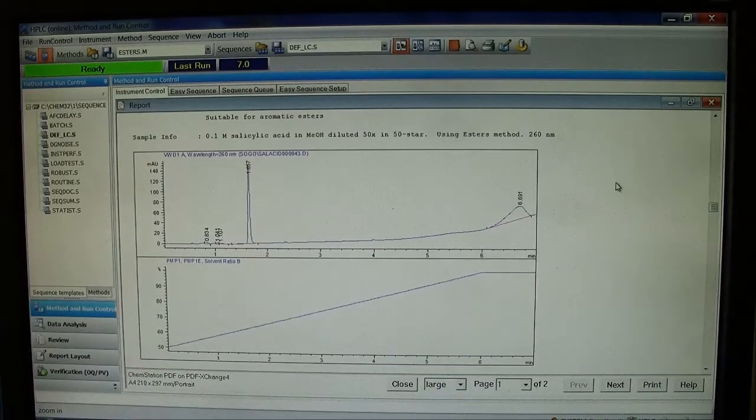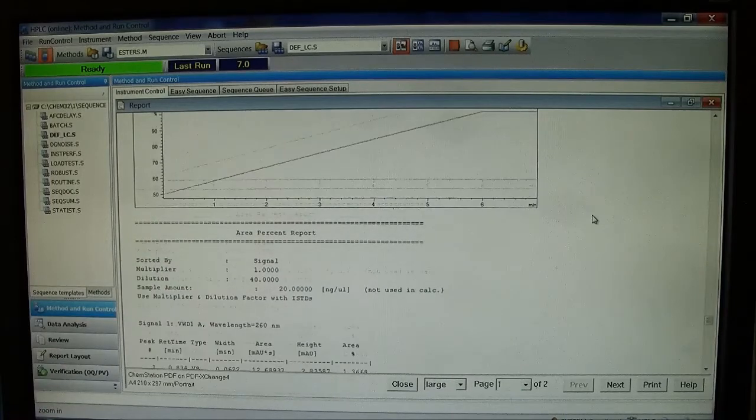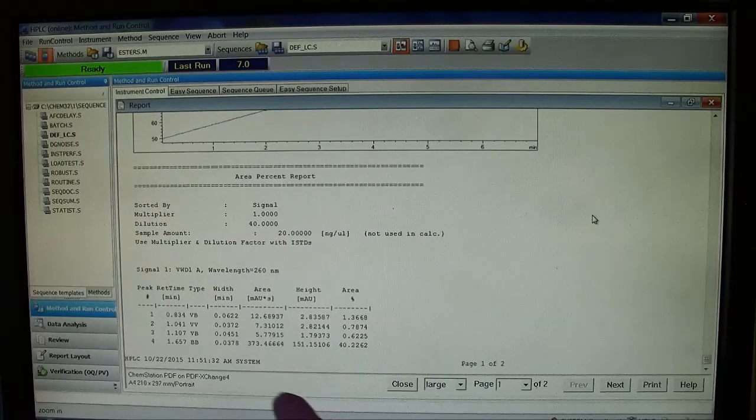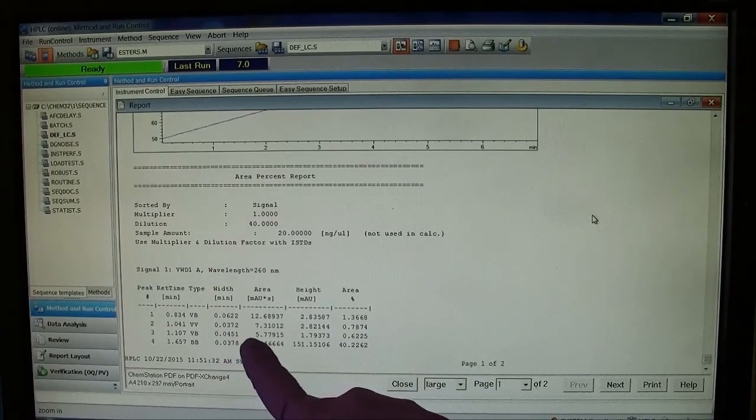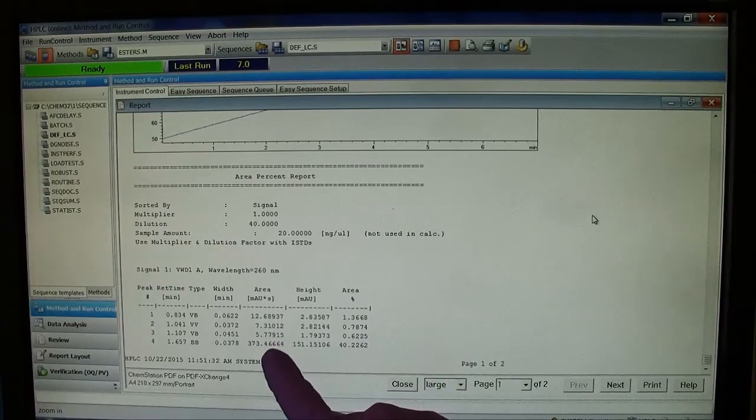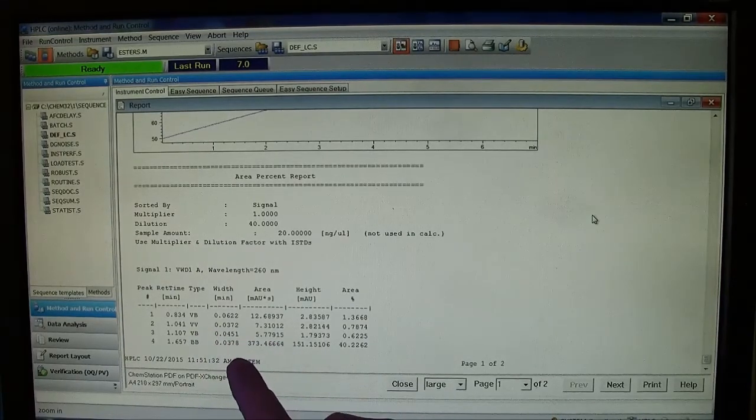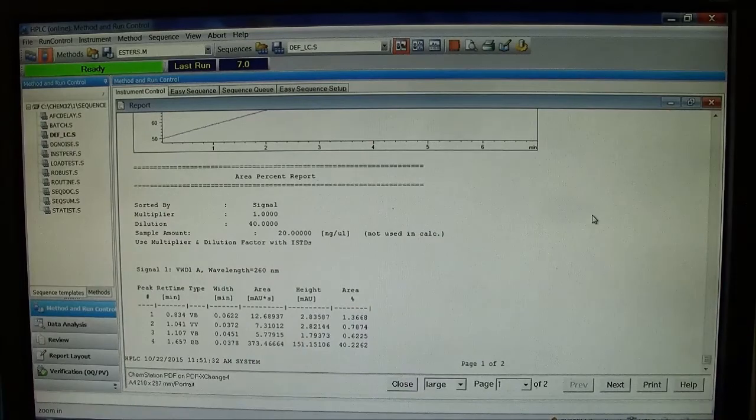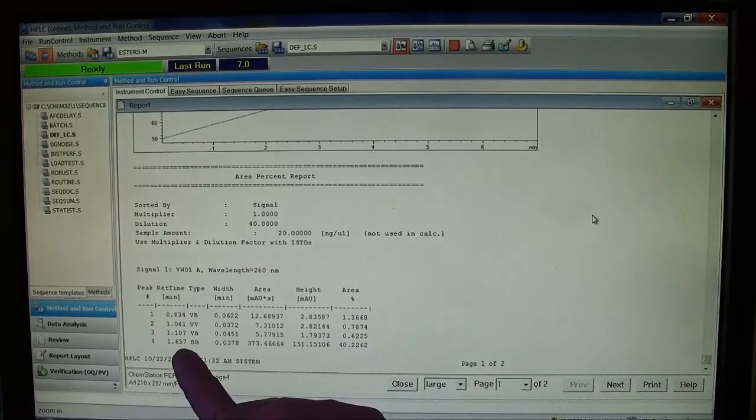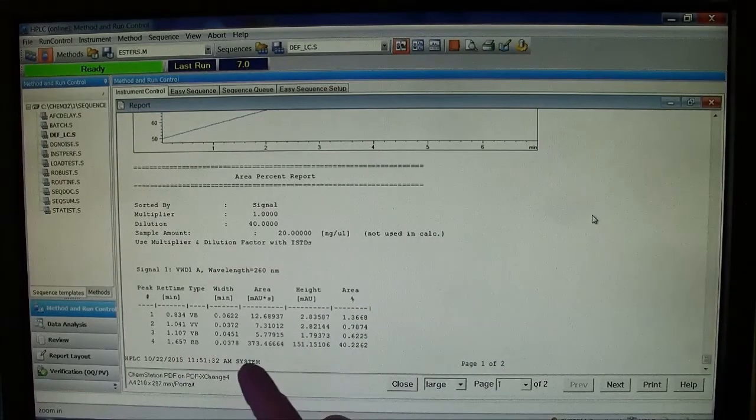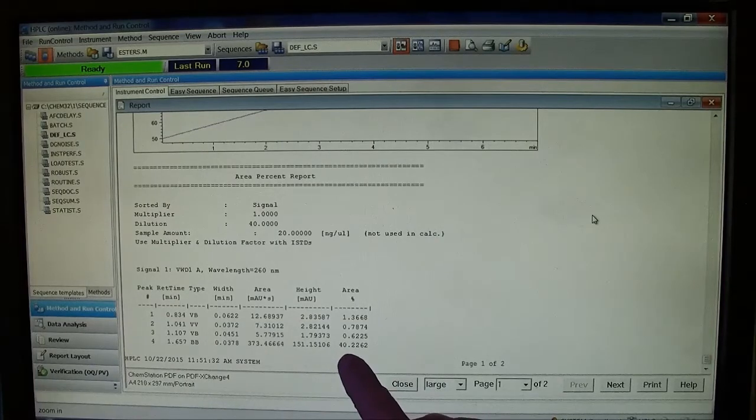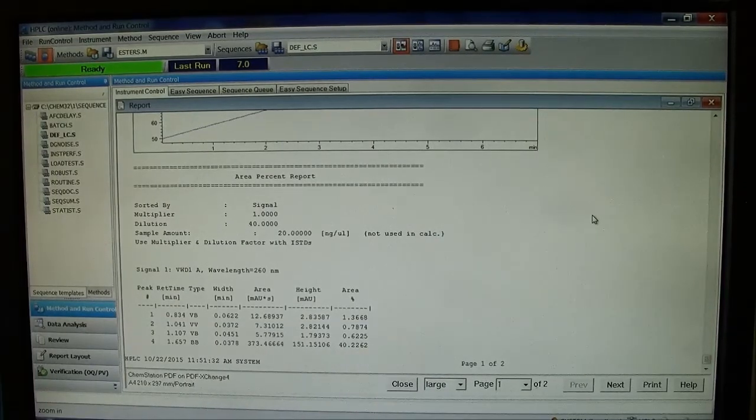If I scroll down, I get a peak report. The peak that I believe is salicylic acid is coming out at 1.657 minutes and has this percent area.